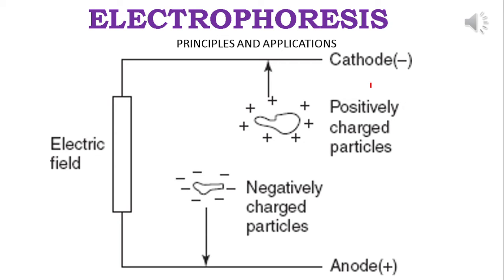Welcome to the topic of electrophoresis. Electrophoresis is the separation of charged particles on the basis of their charge and also the molecular mass by the application of an external electric field.